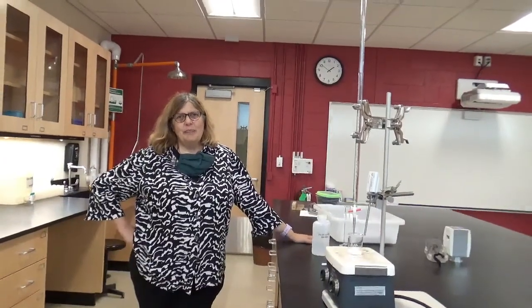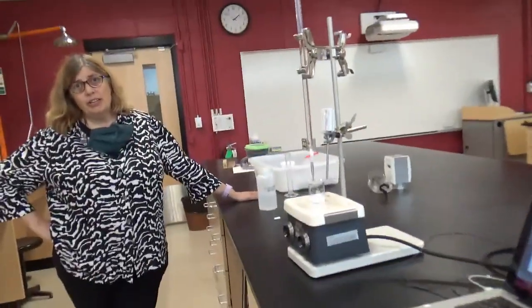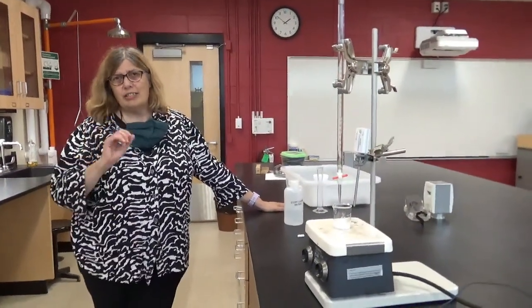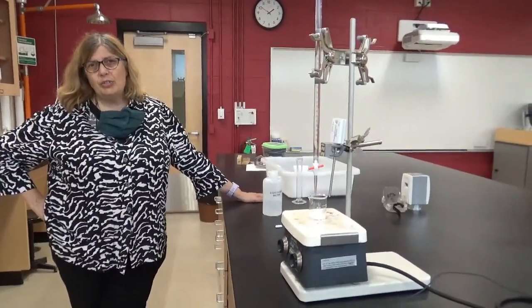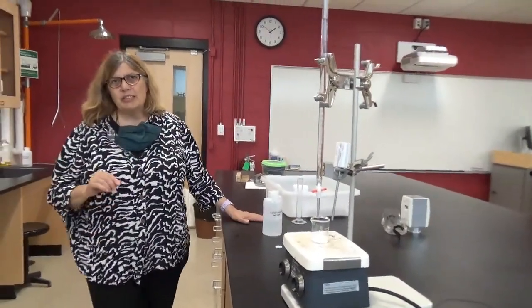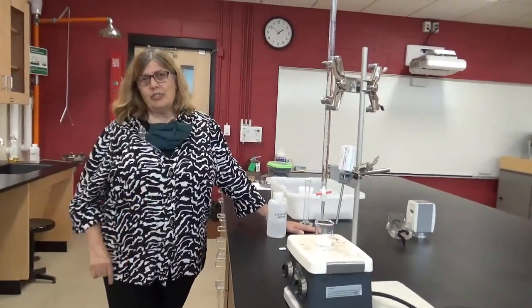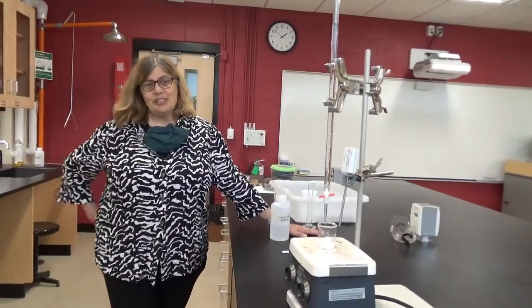Okay. All right. Hi. Well, we're about ready to do the second part of this lab, which is to dissolve the urea in water, but to only just dissolve it. In other words, we don't want to add more water than we need to just exactly get to the point where every one of those grains of urea disappears. Okay, so in other words, we're making a saturated solution. And the concentration of the saturated solution is actually the equilibrium constant in molarity units.